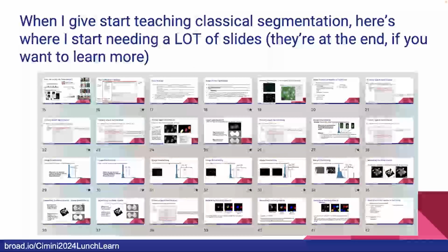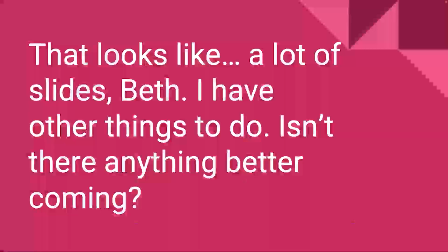All right. So if this were a CellProfiler workshop, now I would start teaching you the principles of classical segmentation. This is not even quite all of the slides that I would be using to do that. It's a lot of slides. It's like a lot of slides.